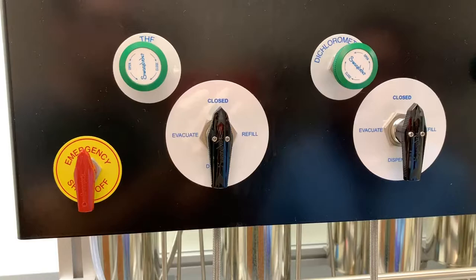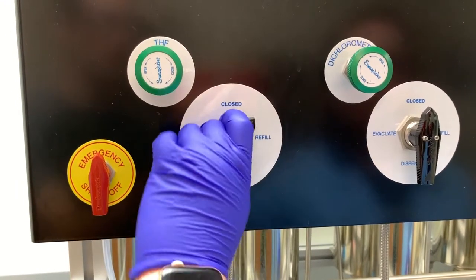For each solvent, you'll have a valve with four possible positions: closed, refill, dispense, and evacuate. Refill will give you nitrogen gas, dispense will allow the solvent to come squirting out, and evacuate gives you vacuum, though we won't be using that function here.